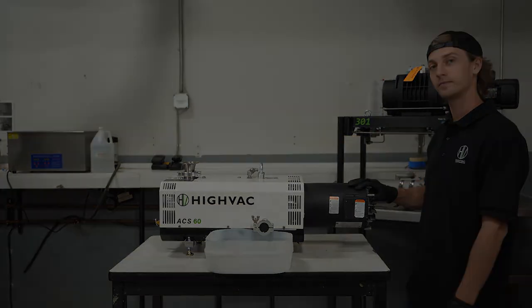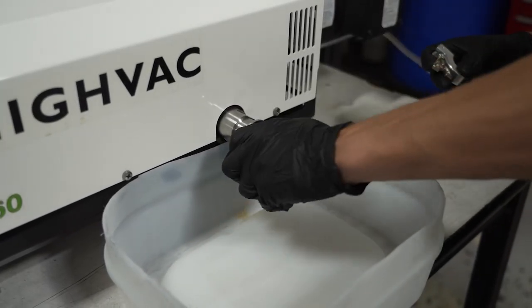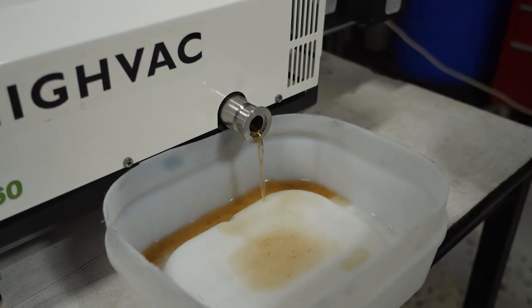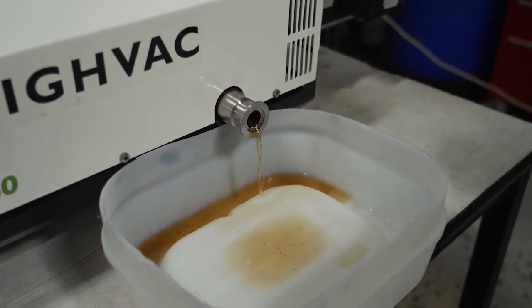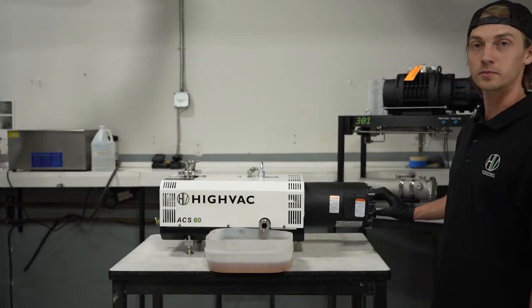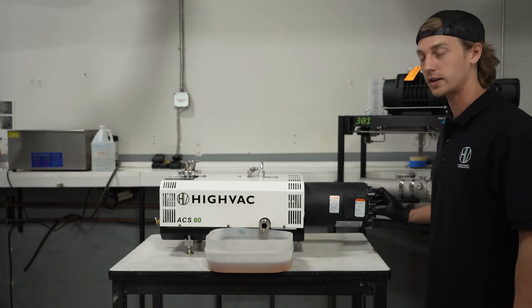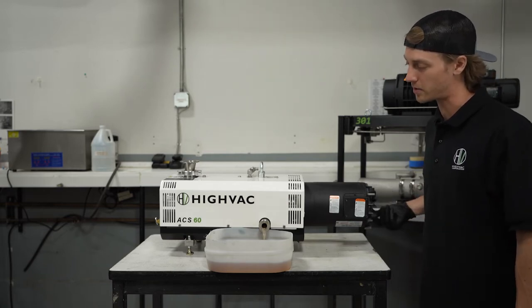Remove the exhaust cap and start to drain the solvent out of the pump. After most of your solvent has been drained, you can get the rest out by manipulating the motor fan — rotating it clockwise to push the remaining solvent out of the pump.